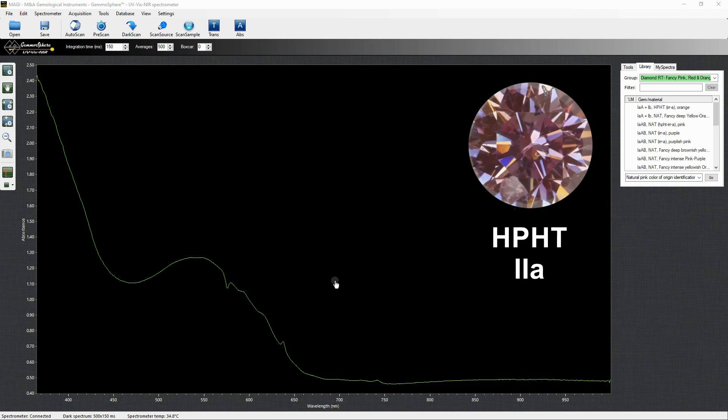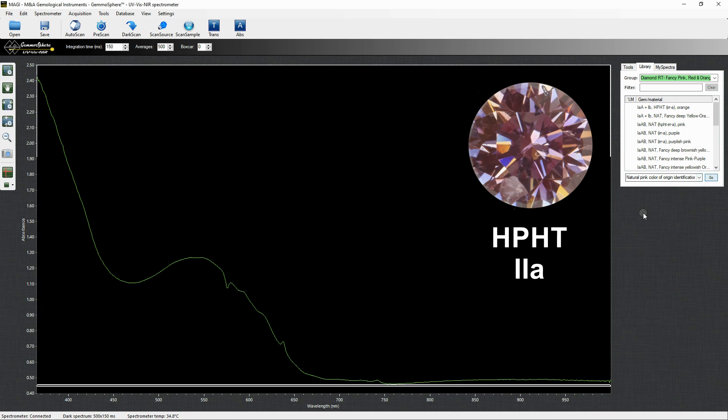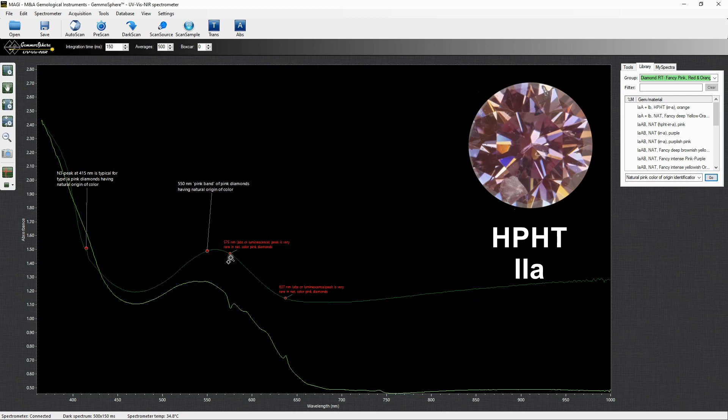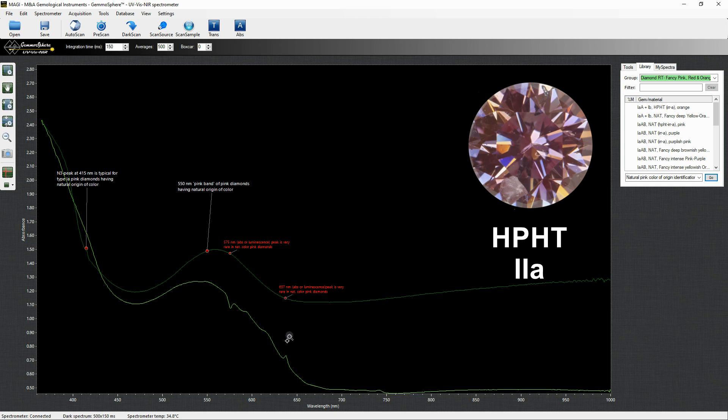In HPHT synthetic pink diamonds the cause of the color are the two nitrogen vacancy defects. Vacancies are generated by irradiation treatment and the annealing process allow them to bond to the few single nitrogen atoms present. Here the GR1 indicating the artificial irradiation treatment.